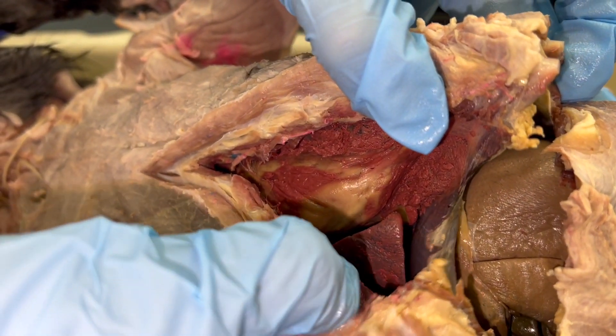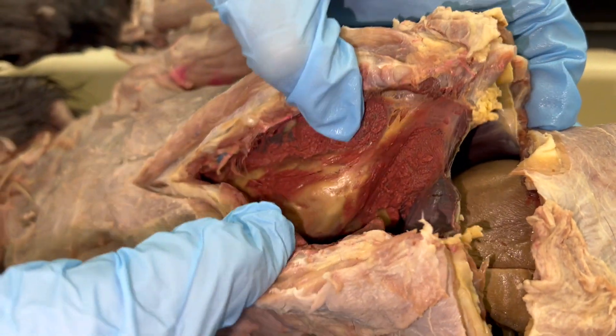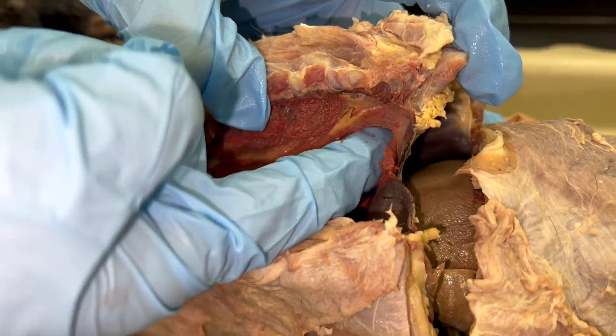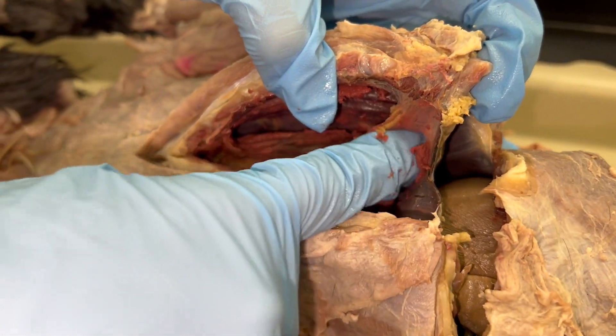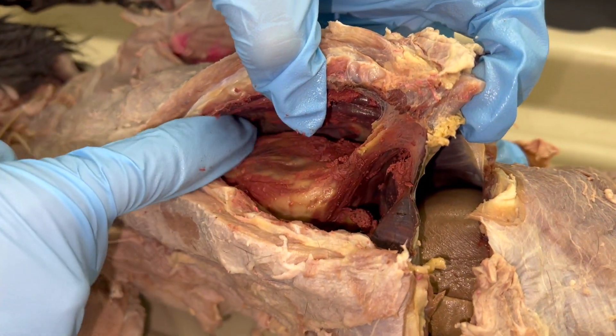What we're starting to see here is the heart, but with a lot of clear stuff around it. You can kind of scoop around the heart itself and separate it from this clear membranous connective tissue.